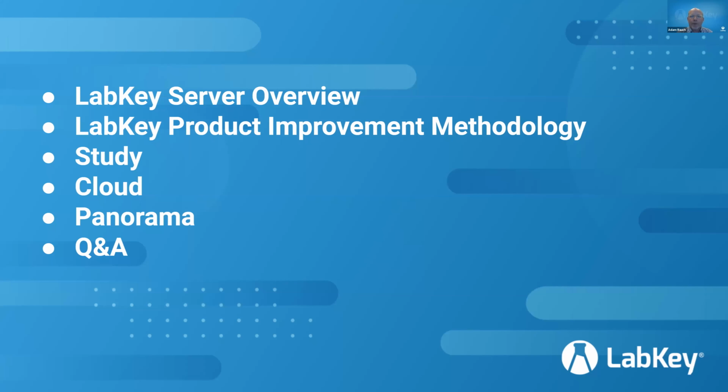I also want to recognize that we have literally hundreds of people on this call. Some of you I know have been using LabKey Server for many, many years and are very familiar with it. And some of you are very new to LabKey. So I'm going to try to provide some overview material along with the cutting edge and newest developments that we've been working on. Kind of give everybody a chance to learn at where they are in their familiarity with LabKey Server.